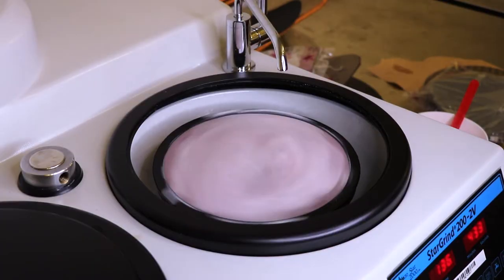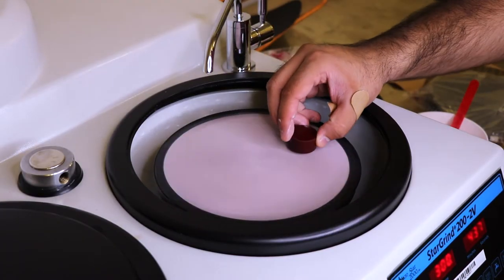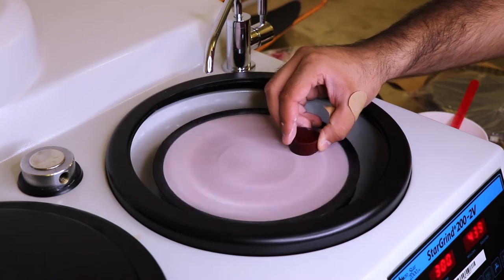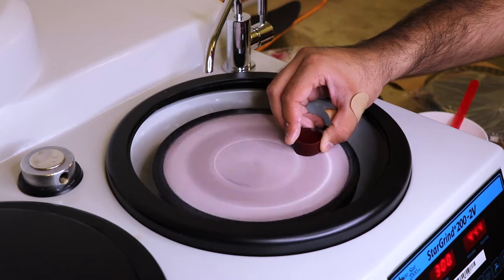Like before, you want to run the machine, then put your sample onto the polishing pad. With this, you can apply a little bit more pressure because the polishing compound does not cut as aggressively as the sandpaper did.